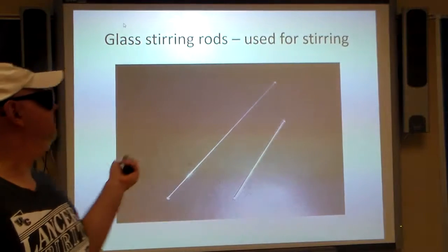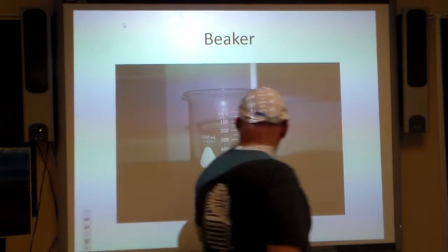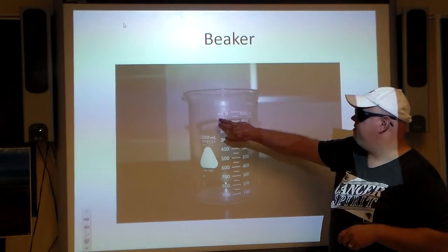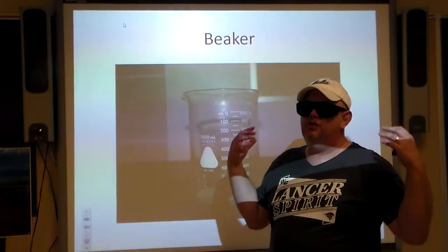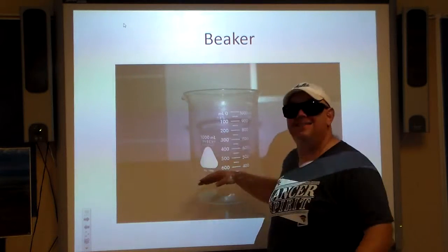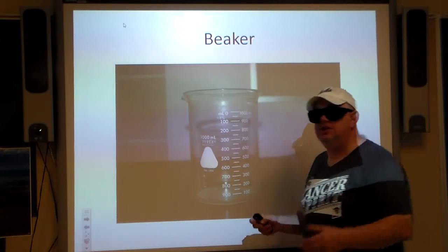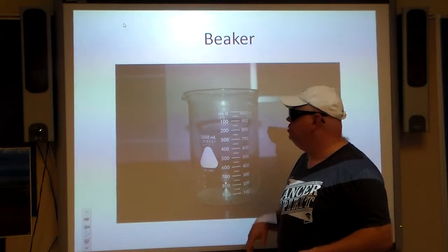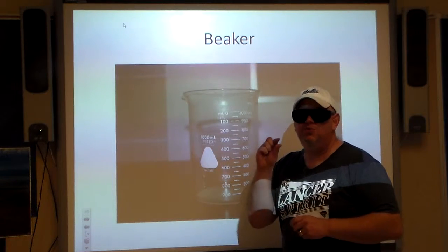Beaker — your basic container. This one is a 1000 milliliter beaker, and you may notice there's a plus or minus five percent tolerance. If I had to measure 900 milliliters of something precisely, I won't use a beaker for it, but it's great to give us an estimate of roughly how much liquid we have. They do come in different sizes — some are really huge, up to 2000 milliliter, but they also come in 10 milliliter, and they're so cute.